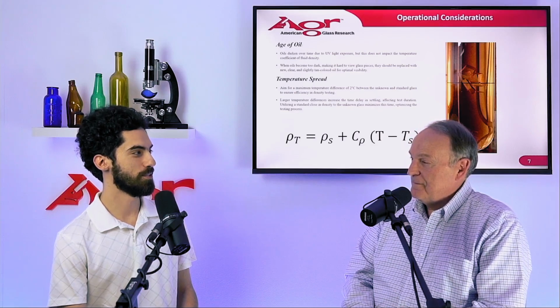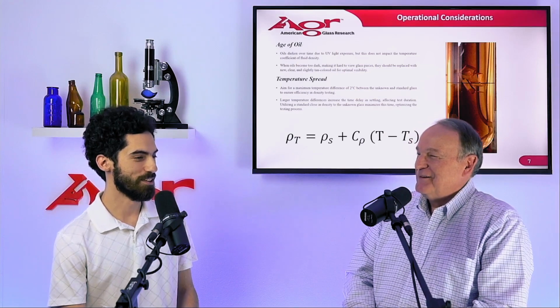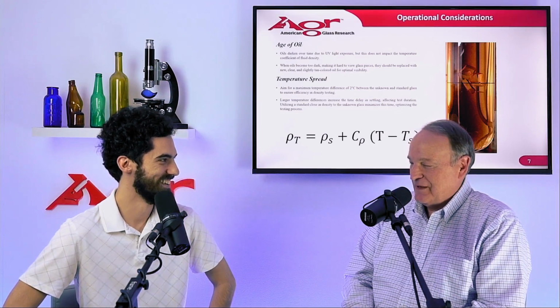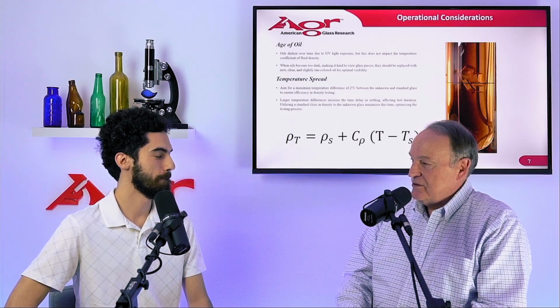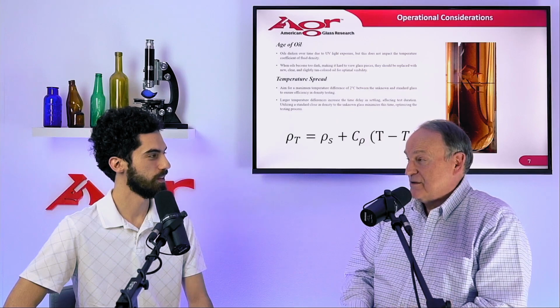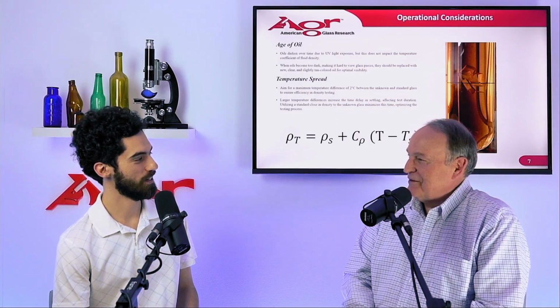That's a whole episode on TV, about 20 minutes. So you're sitting there watching glass fall. That's not very entertaining. It's like watching paint dry or grass grow. It doesn't affect the accuracy of the test. You could have a temperature difference of 4, 5, 6 degrees centigrade, but no one's waiting an hour. It's not reasonable. It's not efficient.